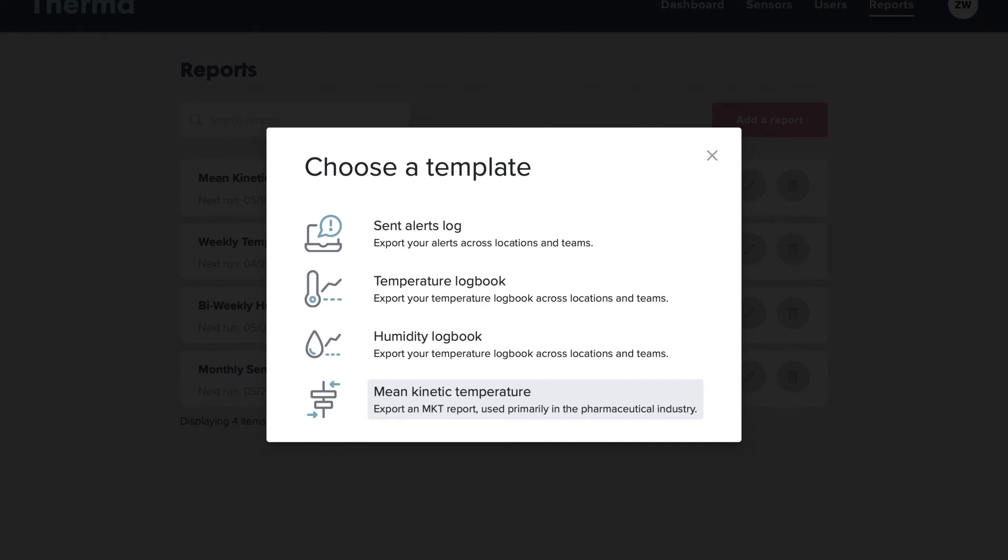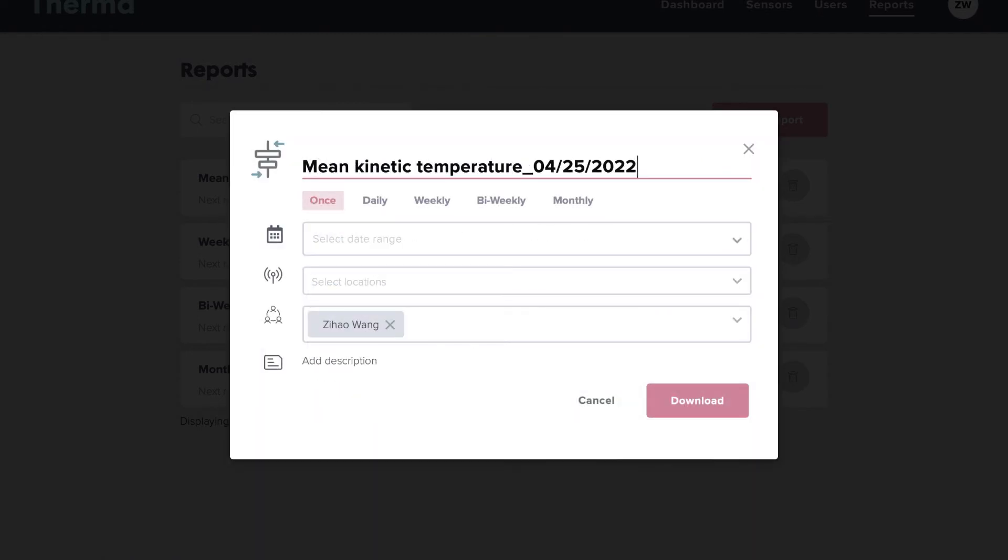After selecting your report type, pick if you'd like a one-time or recurring report. One-time reports will download instantly.